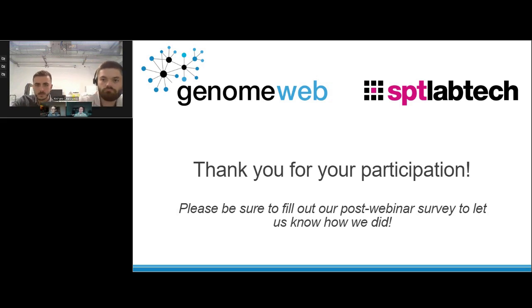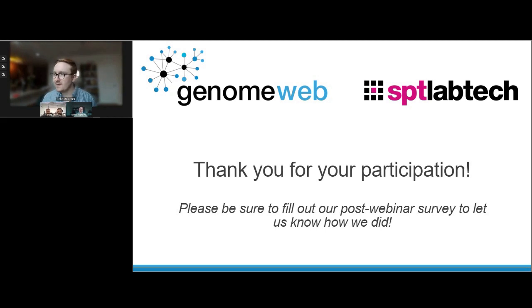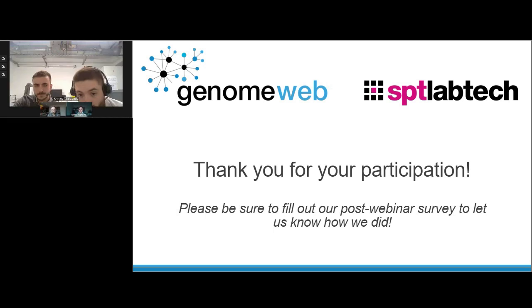And what is the read depth per sample at the current multiplex using the XP flow cell? And what is the variation per sample? Okay, so again with the Nova, to be perfectly honest, we are kind of underusing it. The Nova is able to take a lot more samples in one run. So the depth per sample is not something that we worry about.